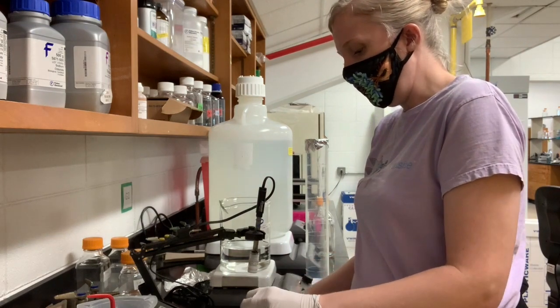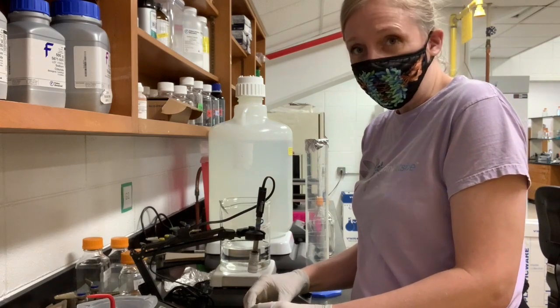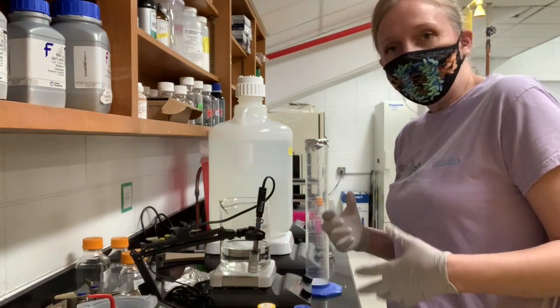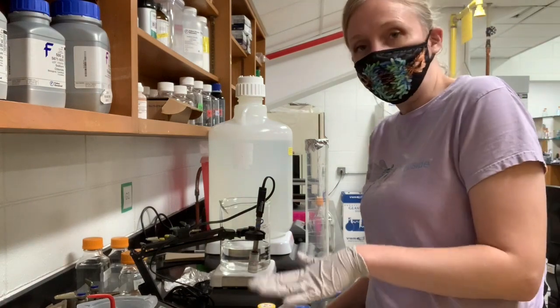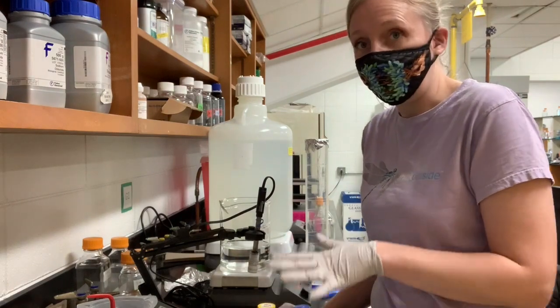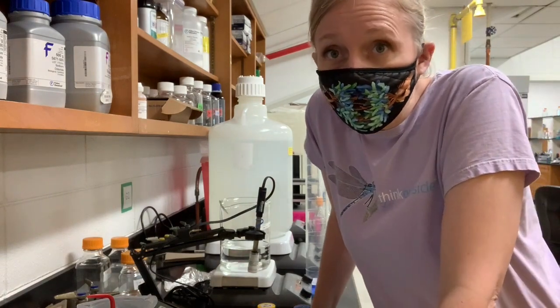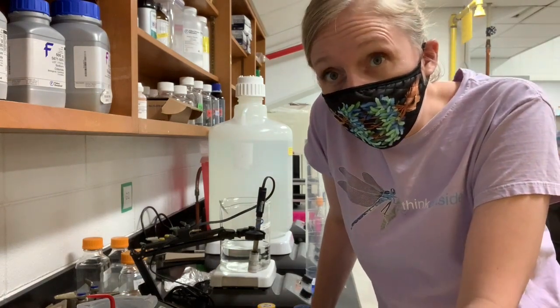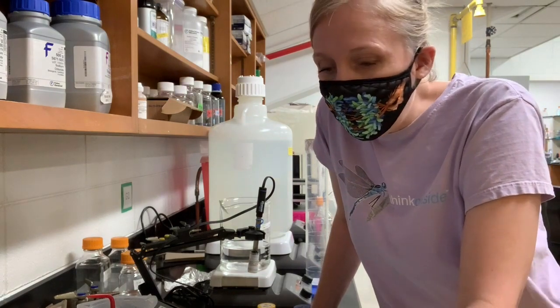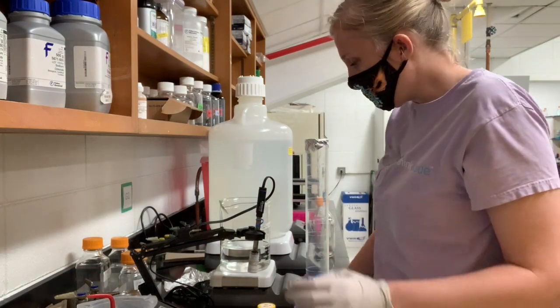And usually I just do a 2-point calibration unless I think something is wrong. So if I'm going to pH a solution that's between 7 and 10, I will use those as my 2-point calibration, but you can use all 3 if you want when you're first starting out. If someone has used the pH meter pretty recently, it will probably be calibrated, but it's always good to check because you don't want to think you're pHing a solution correctly when you're actually pHing it incorrectly.